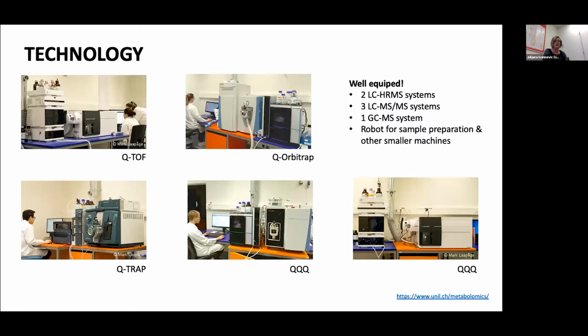In terms of technologies, we are equipped with 5 different LC-MS systems, out of which 2 are high-resolution mass spectrometers and 3 are tandem mass spectrometers. We have recently also installed one GC-MS system, as well as liquid handling robots to enhance the reproducibility of sample preparation.